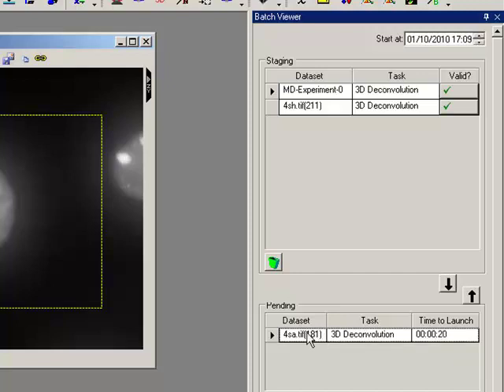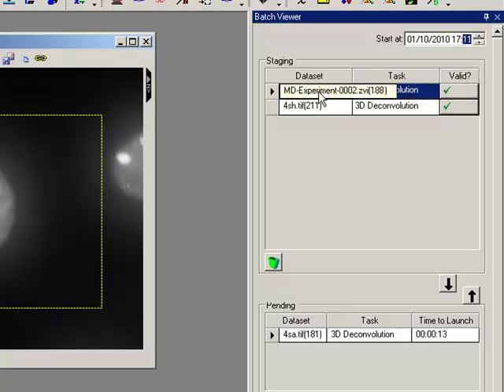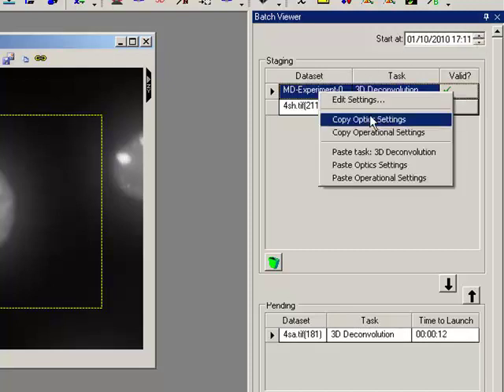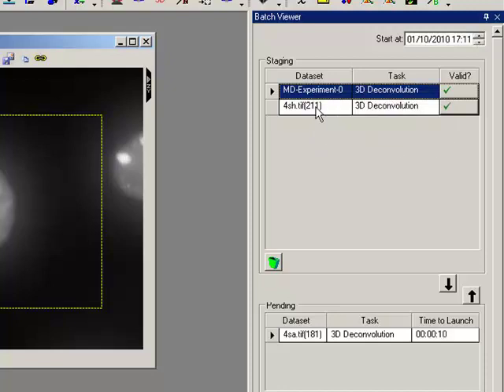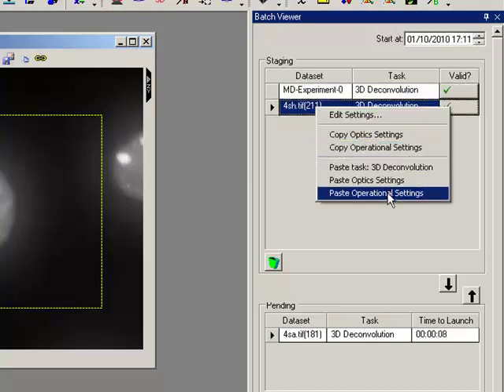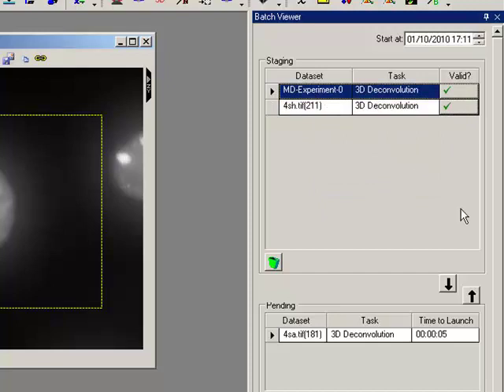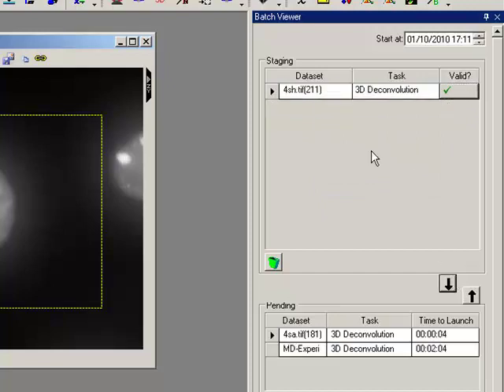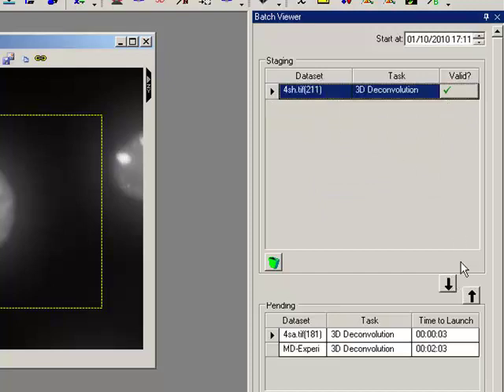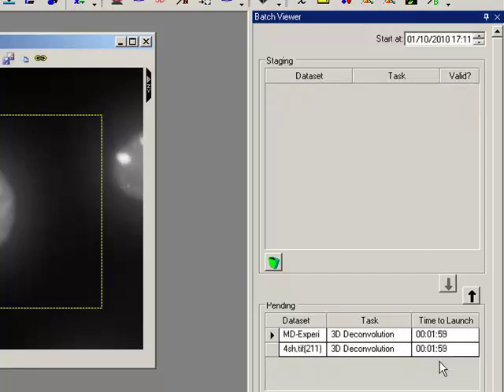So if I was to now set this one to go off at 17:11 and copy the operational settings to this one, copy and paste, send them both into the pending area, they will launch at exactly the same time because the operational settings have been copied.